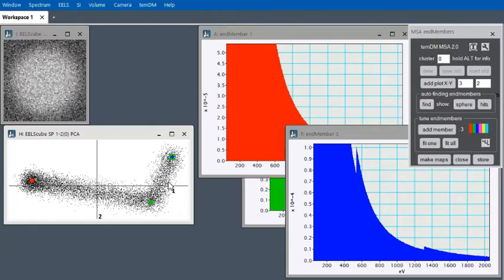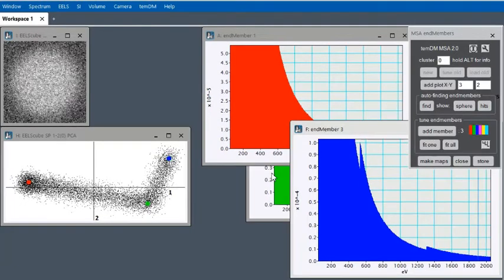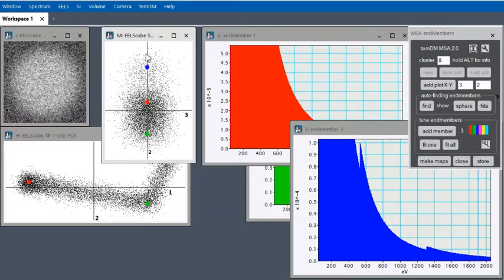We can look deeper into the location of our endmembers in the multidimensional vector space. Let's add another scatter plot. A scatter plot of the third versus second principal component. Just click Add, and here we have an extra scatter plot. You see the third component is added.